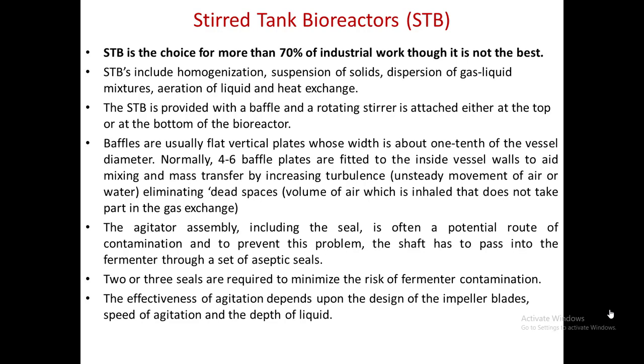The agitator assembly, including the seal, is often a potential route of contamination. To prevent this problem, the shaft has to pass into the fermenter through a set of aseptic seals. Two or three seals are required to minimize the risk of fermenter contamination.